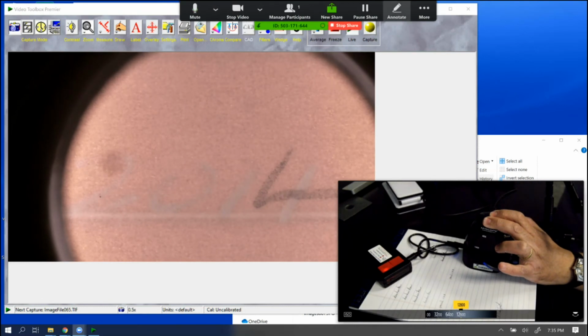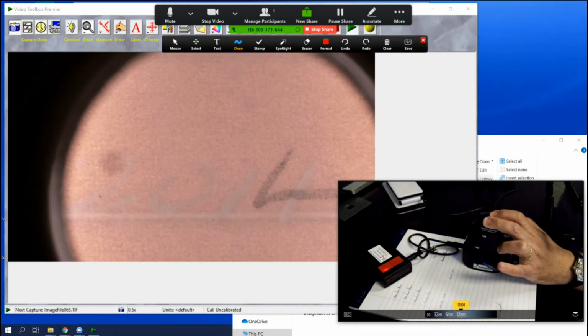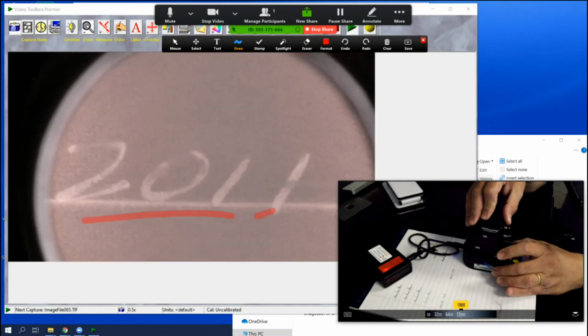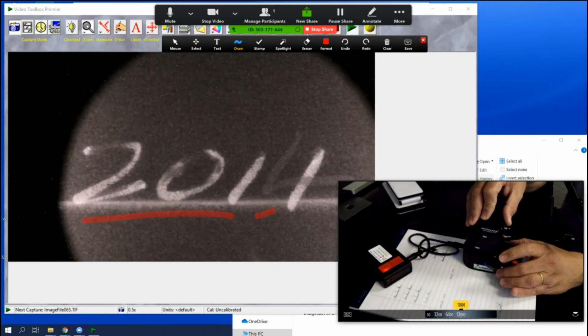All right, there we go. So here we're getting glow in most of the ink, not this section. Now as we switch over, we can see that that effect becomes more pronounced.